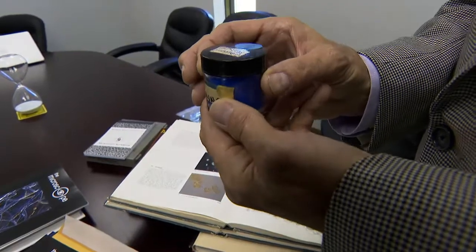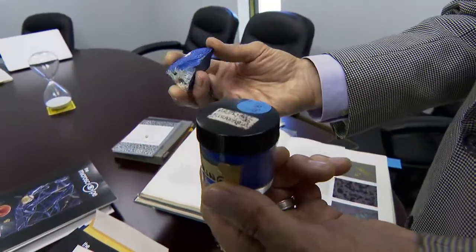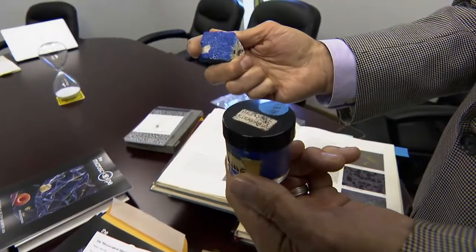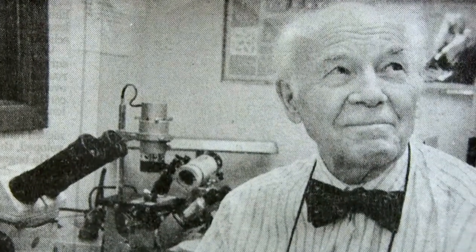This one is synthetic, so this one is modern. The original ultramarine was a crushed up rock, lapis, which is very, very expensive. And of course, because it's so expensive, nobody uses it today. Now, if a forger knew that, they would use the original material. They would even grind it themselves and make their own pigments the way the original artist may have done. I hate to suggest it, but a microscopist might make a good forger. That's absolutely true. In fact, Dr. McCrone used to give a talk, what every good forger should know.